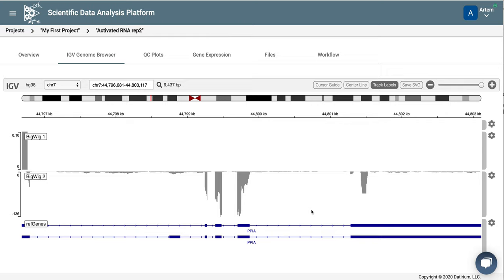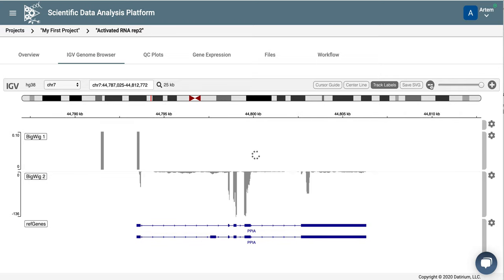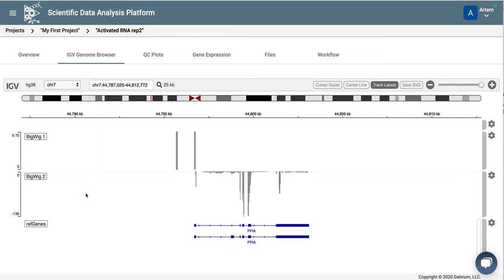And you can also look outside the genes. And as you can see, we have very few reads outside the gene, and this tells us that we don't have DNA contamination.